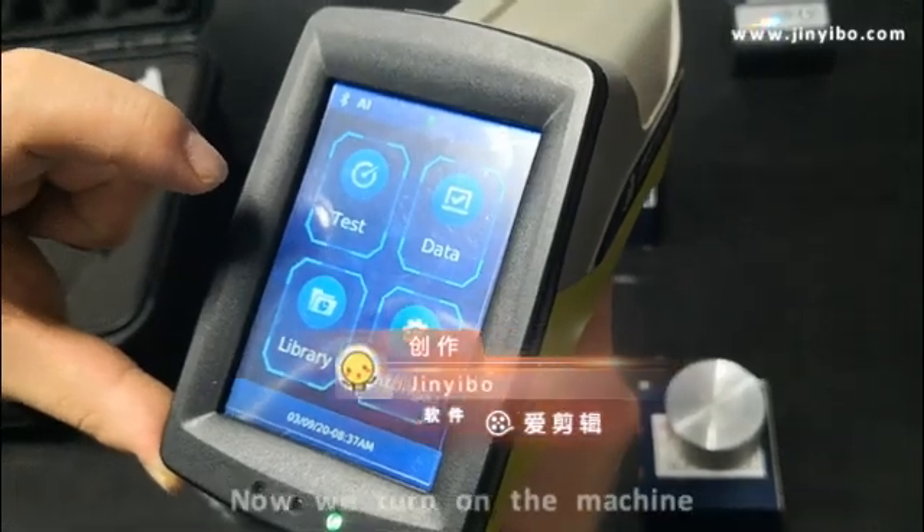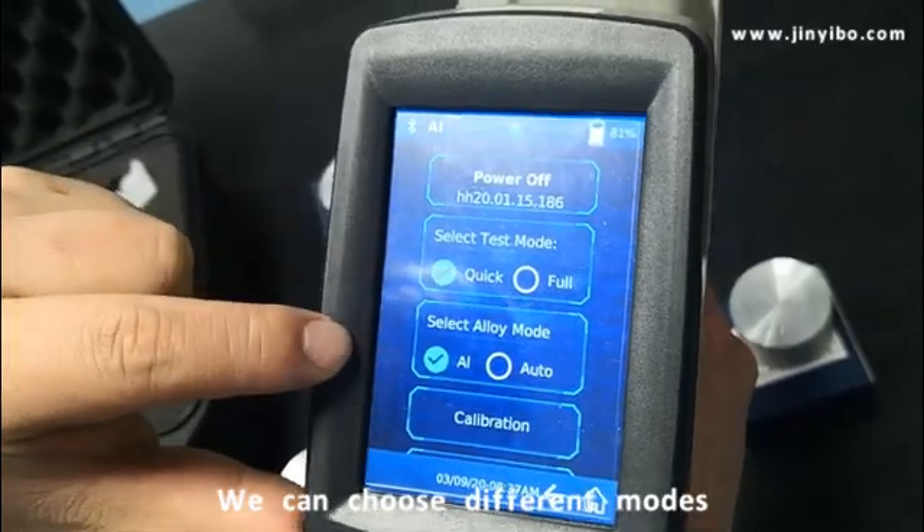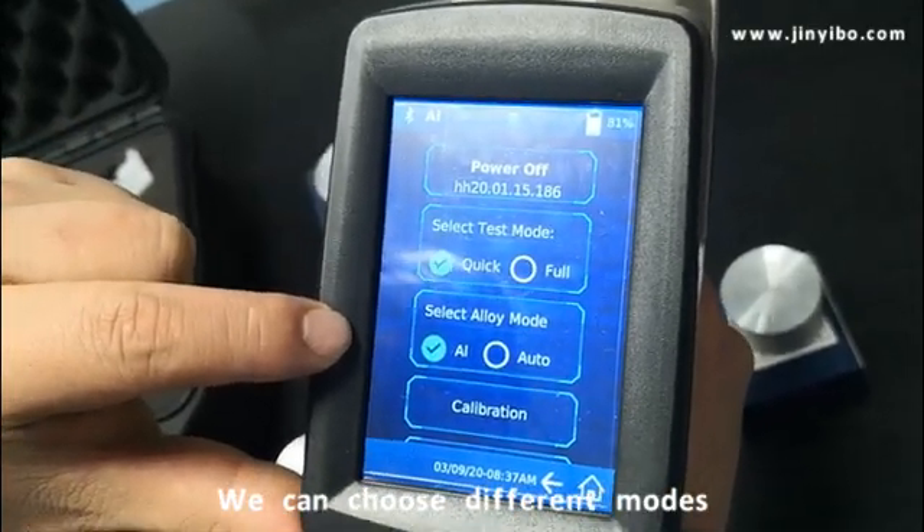Now we turn on the machine, we choose the setting, we choose the quick mode, we choose the Al mode.